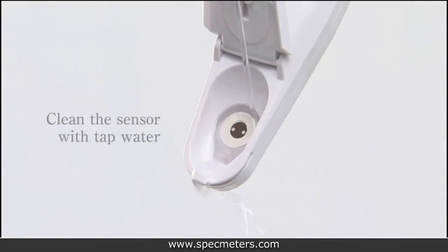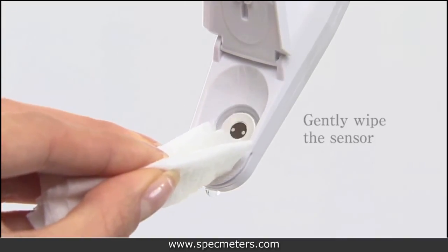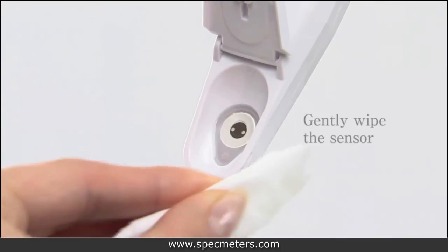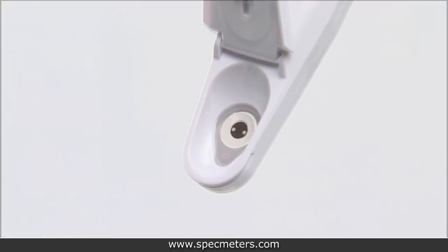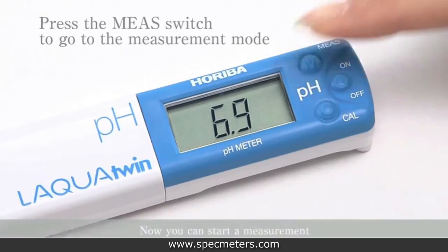Once calibration is completed, clean the sensor with tap water. Then gently wipe the sensor. Press the measurement switch to go to measurement mode. You are now ready to start taking measurements.